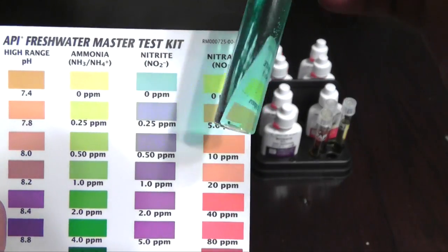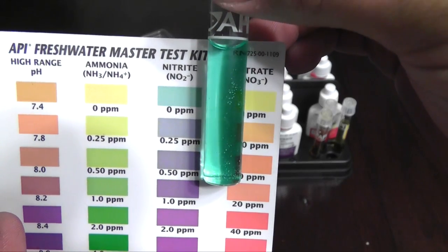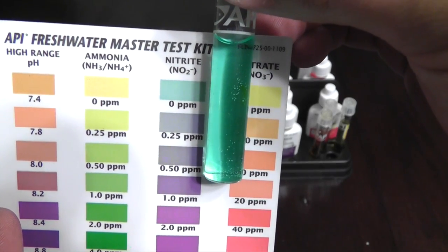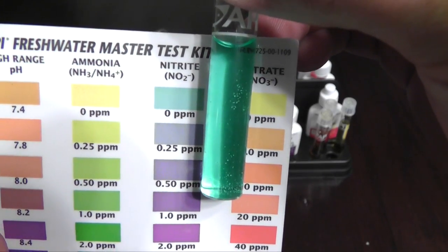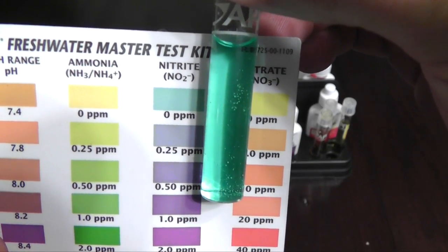This is your nitrites. Your nitrites here are what comes after the ammonia. And my nitrites are at zero parts per million. So that's good.